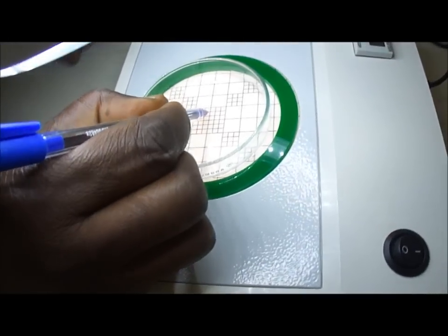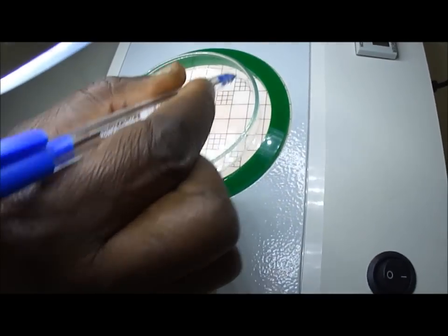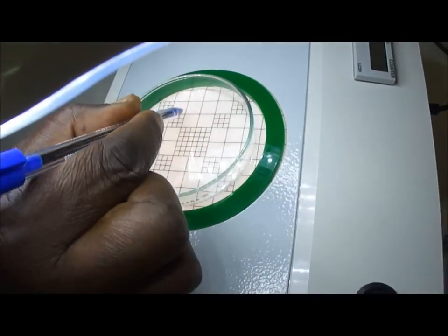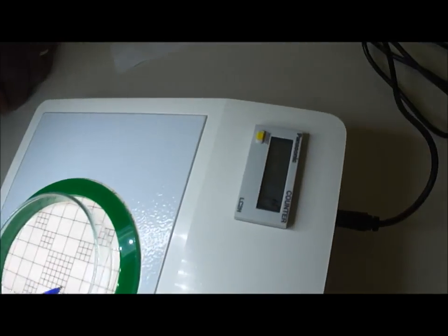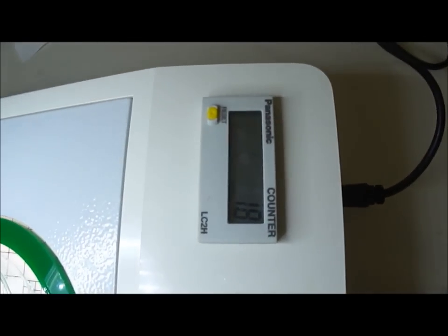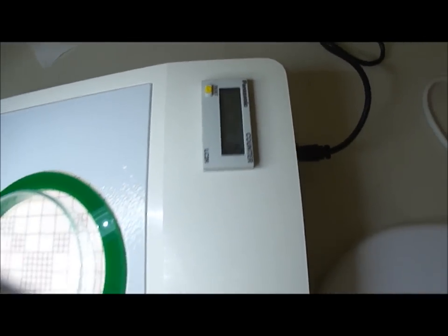Much easier, because you have magnified them, and the number is displayed in the counter. So, this is very practical for counting the bacteria.